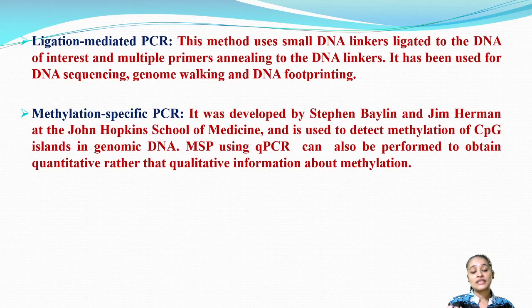Now let us see what is methylation specific PCR. It was developed by Stephen Baylin and Jim Herman at the Johns Hopkins School of Medicine, and it is used to detect the methylation of CpG islands in genomic DNA.